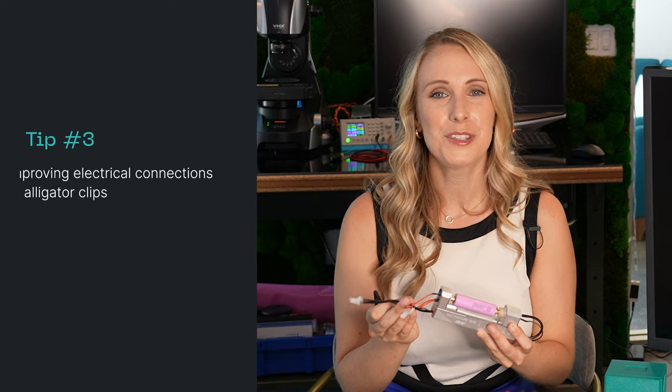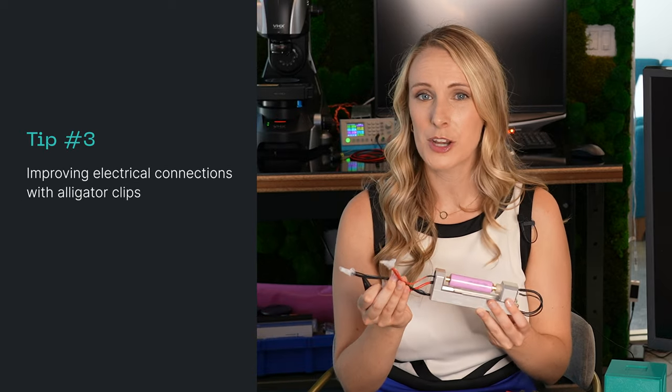Once you determine whether you're using a two wire versus four wire measurement, you'll want to connect those alligator clips to the leads of the cell holder. I have these leads wrapped in parafilm just for safety reasons, because if they touch, they will shock — that can not just shock me, but also shock the battery, which I don't want to short. For a cell holder like this, it's fairly easy to connect the alligator clips. You simply want to make sure that they're in contact with the lead, and I like to press down extra hard to make sure that they're making that electrical contact.